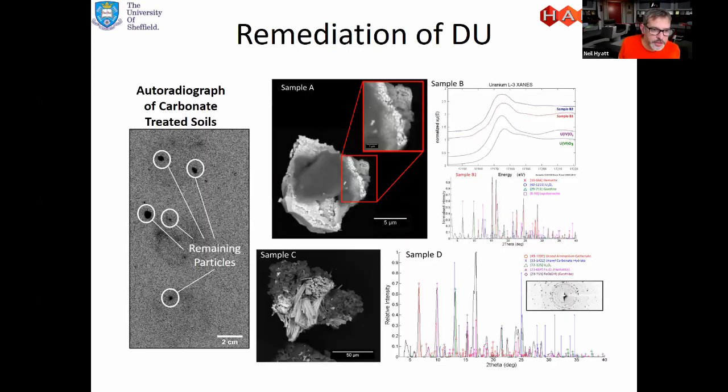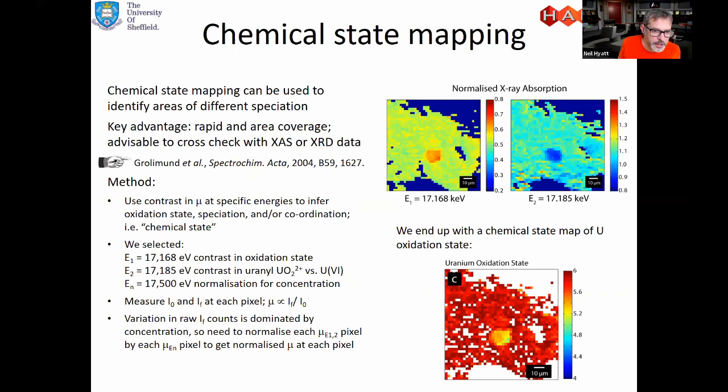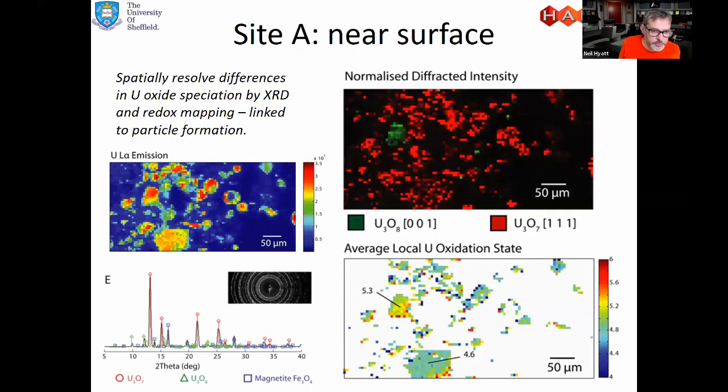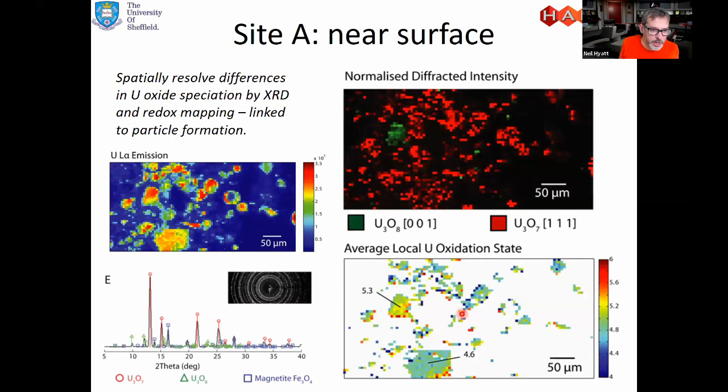Right, yeah, so I think that's shown maybe here on this slide. I'm sure we've actually got data to back this up. I guess it's one of these spectra here, but you can see it quite clearly on this slide that you probe an oxidation state of essentially 4.6, which is a little in excess of 4 and consistent with what you expect for U3O7.